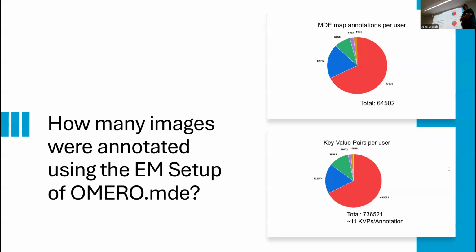It's much better if you can retrieve your results. I think the general problem is that people feel they can retrieve the results even though they don't have metadata. They will remember everything, at least that's what they think. I think the new PhD student does, for the first 3 months. I didn't annotate any metadata in my PhD. But how sure are you that what you annotated before is true, or that you didn't check it? Maybe I annotated in another way, like in my not electronic lab books and in the titles of my files. Yes, I did. That's why I can remember.